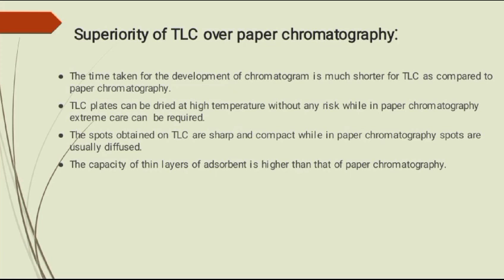Superiority of TLC over paper chromatography. The time taken for the development of the chromatogram is much shorter for TLC as compared to paper chromatography. TLC plates can be dried at higher temperature without any risk, while in paper chromatography, extreme care is required. The spots obtained on TLC are sharp and compact, while in paper chromatography, spots are usually diffused. The capacity of the thin layer of adsorbent is higher than that of paper chromatography.